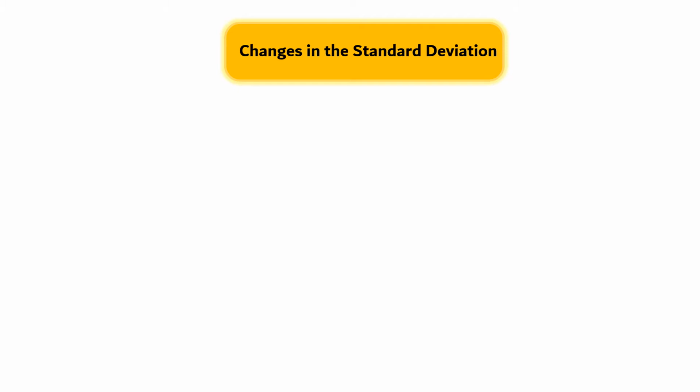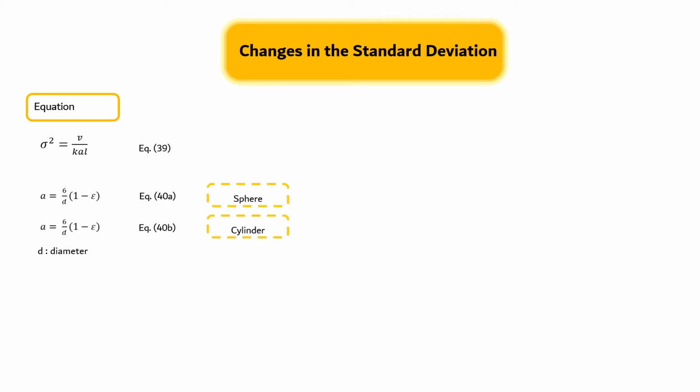Standard deviation is the key in scaling up chromatography, which can be calculated by using equation 39. In particular, the area per volume A for a packed bed of spherical particles is given by equation 40. The variation of rate constant K depends on the step which controls the interactions of solute and packing. If the step involves diffusion and fast reaction within the particles, then K is independent of the velocity outside the particles and can be calculated using equation 41.